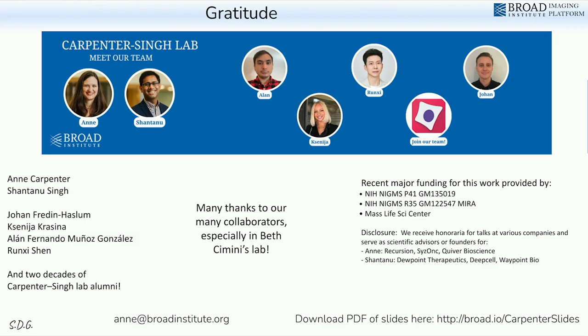Great talk, thank you. I'm really interested in the optical pooled screening. I'm wondering if, after you've collected the disease phenotypes for the 200 or so different diseases you have, can you use that then to barcode the cells rather than reading out a hybridization? Because in theory, each disease type has its own profile.